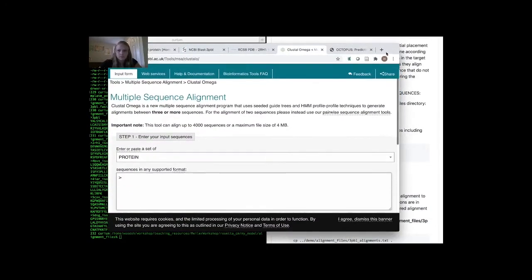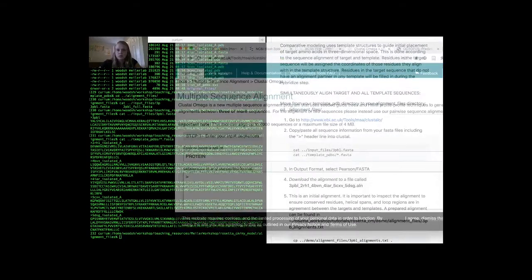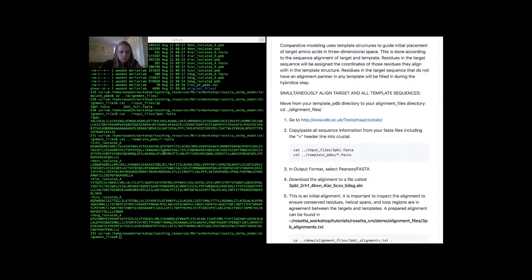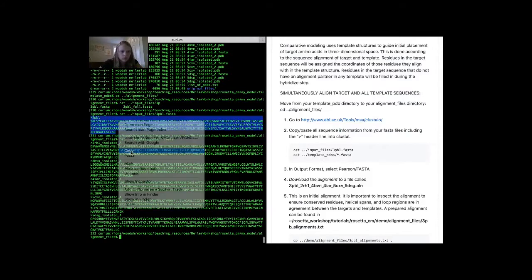So then you'll want to go to the Clustal Omega website, and you'll copy that in there.